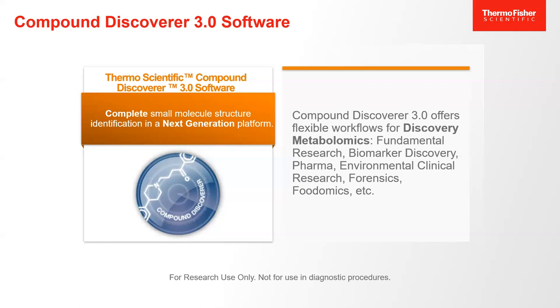Okay, now. I do want to mention Compound Discoverer and Proteome Discoverer are both restricted open source. What does that mean? It's a little strange term. Thermo owns the code and the rights to Compound Discoverer and Proteome Discoverer, but the results files are totally open source SQLite databases. Okay. When you get a PD result file out or a CD result file, same exact thing, the output, that is totally an open source database. Thermo offers courses generally every year, and we actually teach you for 2 days how to program against it. Okay. It is completely open to you. All the nodes that do all these processing steps is all freely available code that you can modify, and you can write your own.